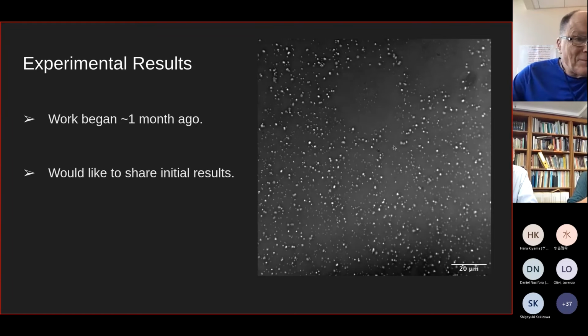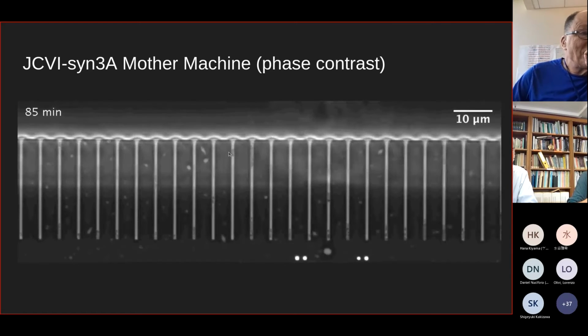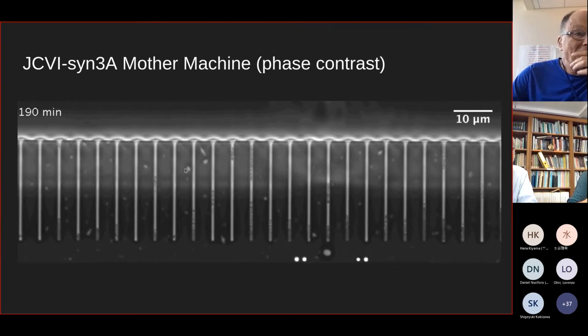Again, we started a month ago, and also I am a physics student, so some senior members of the lab had some comments about my data quality. But yeah, I'm excited to show you guys some early data. So this is Syn 3A growing in a mother machine.